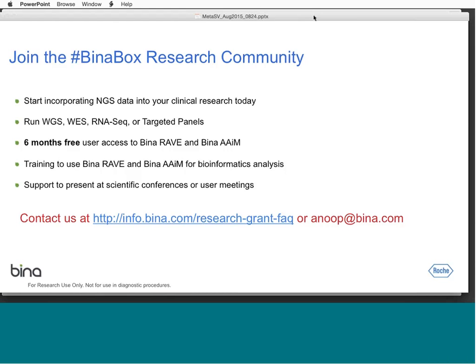Question from Rashesh Sangvi. Have you tested with long reads? No, we have not tested MetaSV with long reads. We have, however, investigated MetaSV with 250 base pair reads, so that seemed to work. If you look at our paper in the supplementary, we do mention the MetaSV accuracy assessment with 250 base pair end reads.